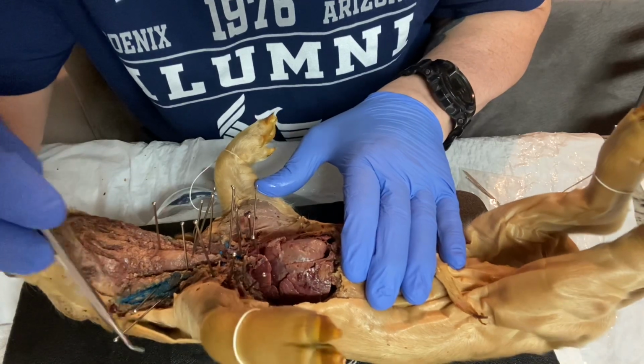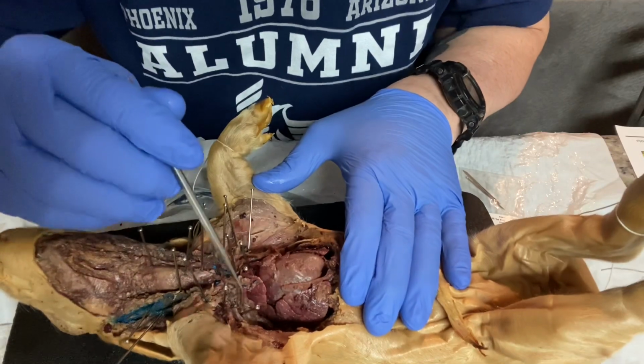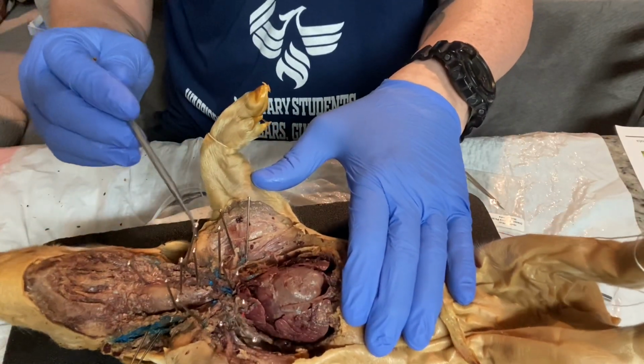And I think I covered everything. And hopefully you can make this out with the pins and the markings that I did. And that will conclude my video.